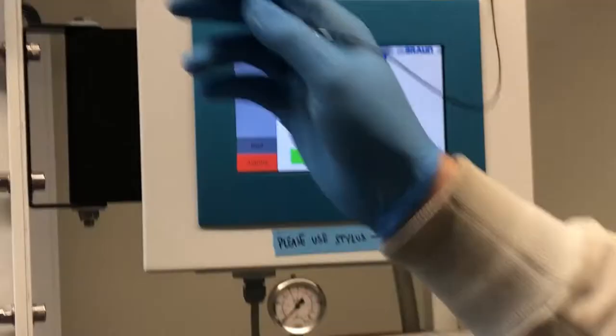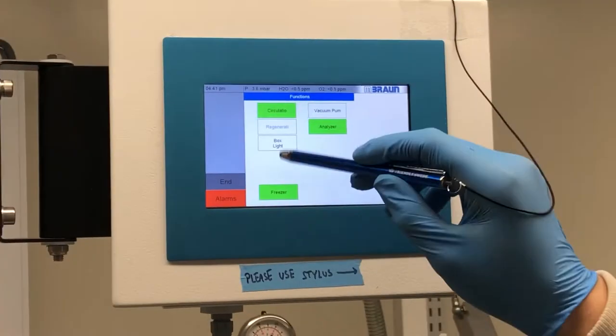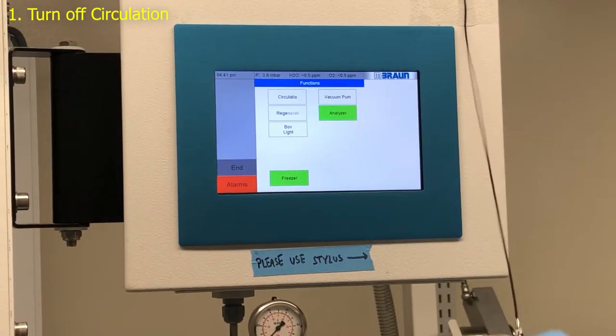So the first thing we're going to do, I have the box light on, but it could be off, it doesn't matter. But you want to turn off circulation, alright, that's the first thing to do.